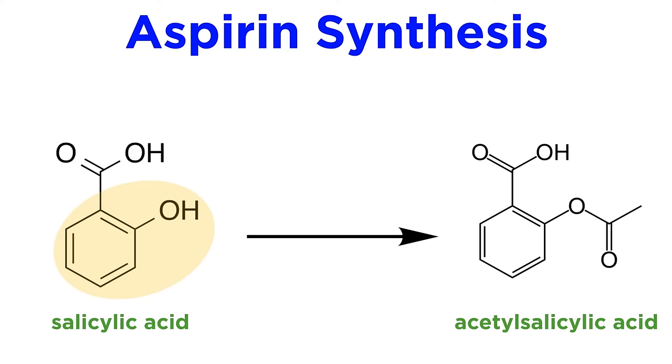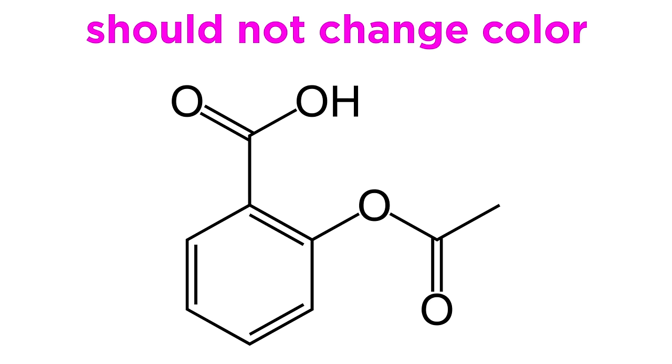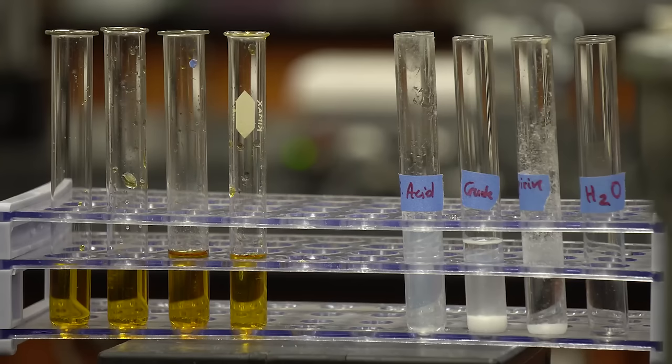So if we add both the starting material and our product to tubes, and introduce iron-3 chloride, the salicylic acid should turn purple and aspirin should remain brown. So if we have made and purified our aspirin, it shouldn't change color. If it does, either we didn't make any aspirin, or we've made it but didn't correctly separate it from the starting material. So let's test our products. Here we have a tube of our starting material, a tube of our crude product after the first crystallization, and a tube of our final product. We've also added a tube of pure water as our control to make sure that our test works correctly.